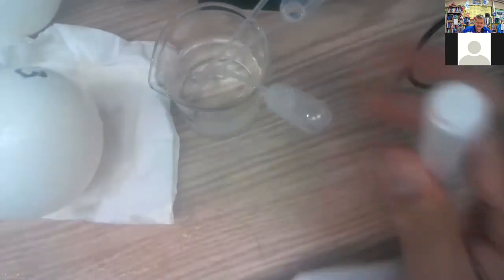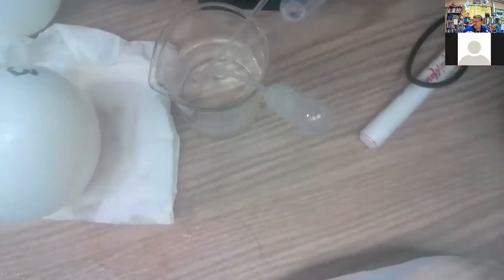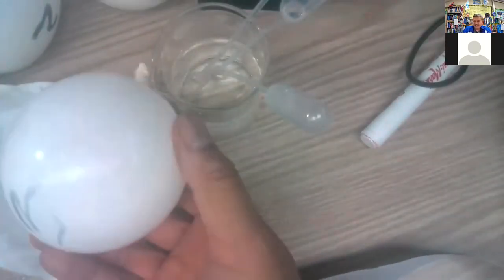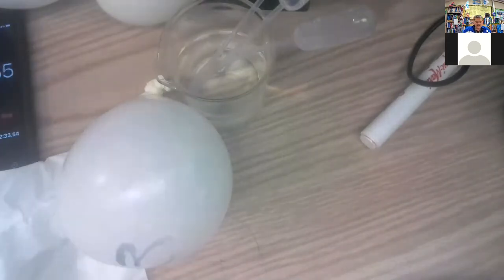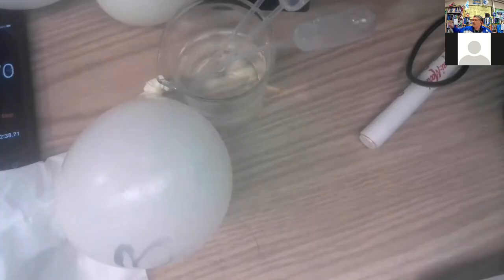Right, so there's the third one right there, and I bet you it would have been greater if I had been able to hang on to that and not make a mess. See that it's starting to expand. Shake that. We'll take a measurement in just a couple minutes now for the 5 minute measurements.